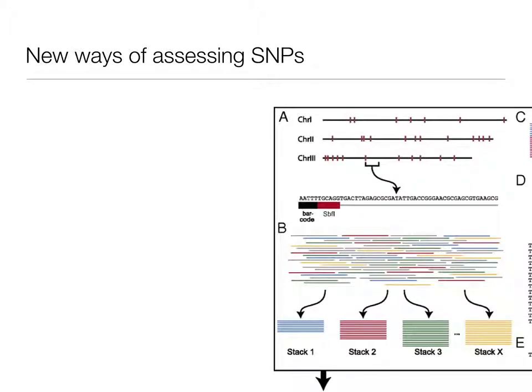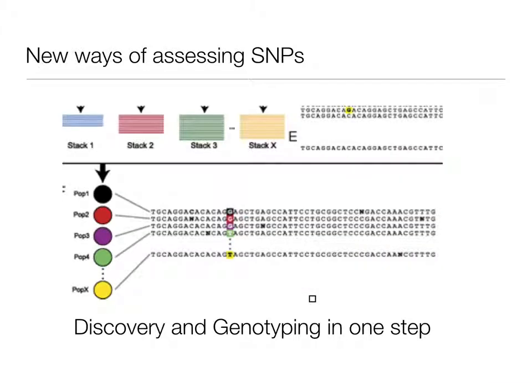and so this is old too. This is a separate thing. So if you're doing genomic data, RADSeq, that type of stuff, there's special programs for that. What I was showing you is short read sequences for whole genes lining up and finding SNPs. You've got things such as Stacks. That's kind of the popular open source thing for looking at RAD data, where you just get a bunch of genomic data. The same idea. It stacks them up and it looks for SNPs and finds the variance.